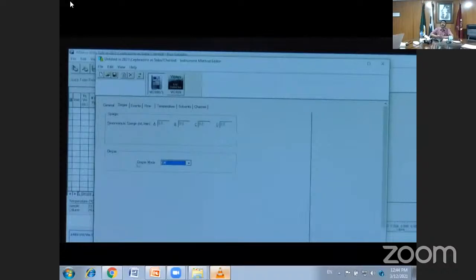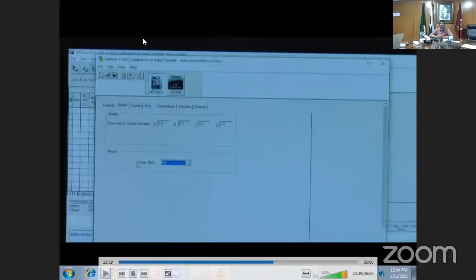There is a question. Some participants ask about the duration and analysis time. Yeah, it's from Shukurov Chaudhary. Okay, so there is no fixed time for the analysis. It depends on the length of the column, the polarity of your mobile phase, and your working environment, so column heater and many things.